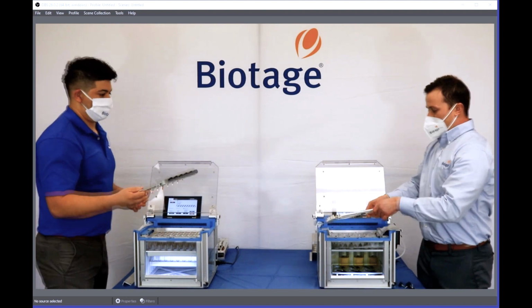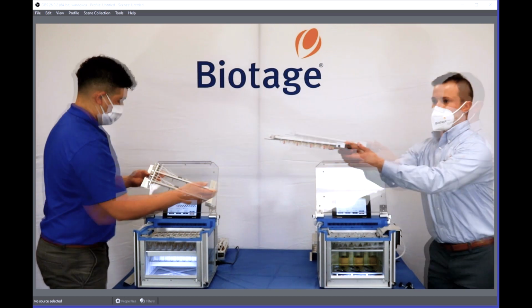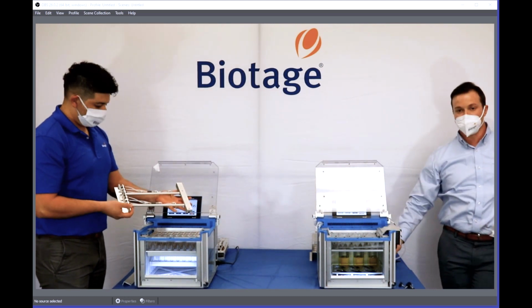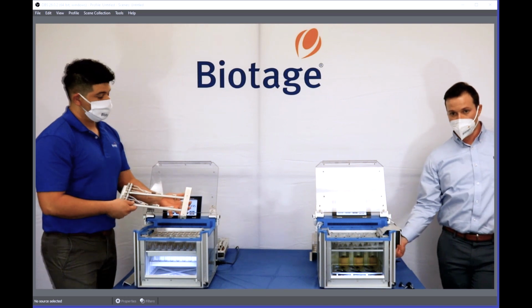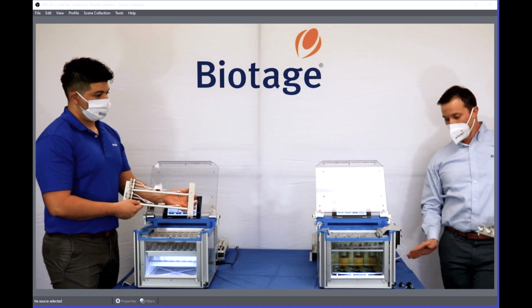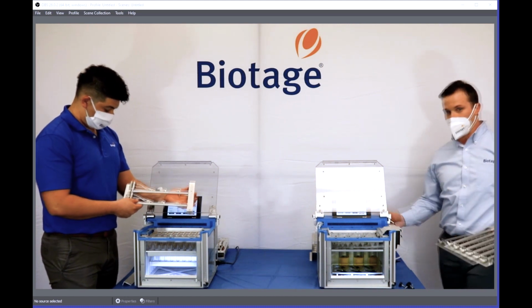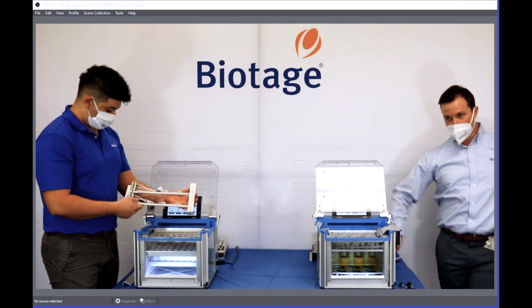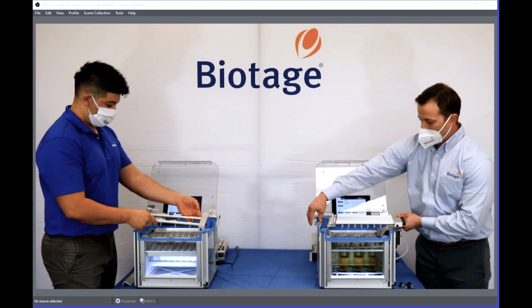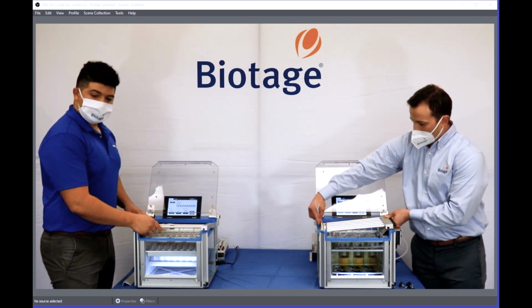Is there a specific area for the quick connect for a nitrogen line? Let's see if we can zoom in. The actual quick connect on the system comes with the system. You're going to want to come in from the left side of the system, or if you're facing me, the right. So right here where I'm pointing, there's a quick connect.